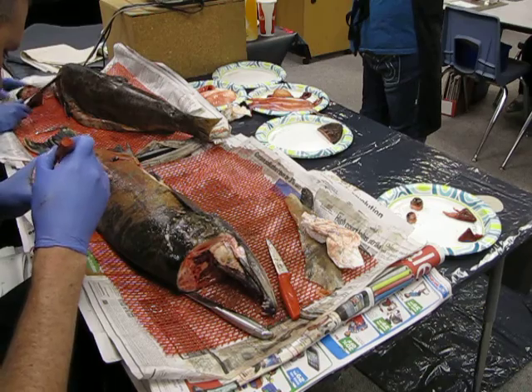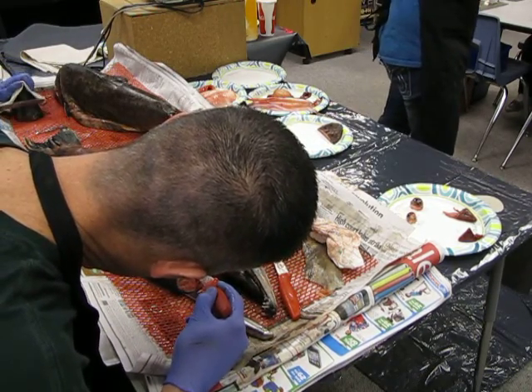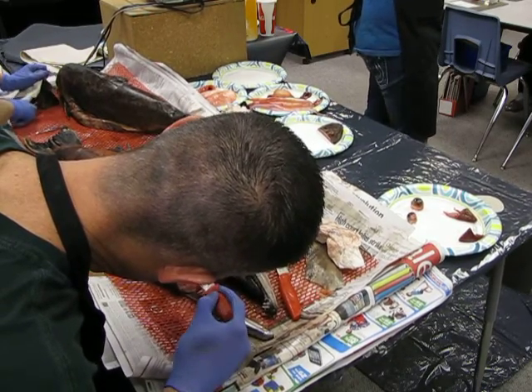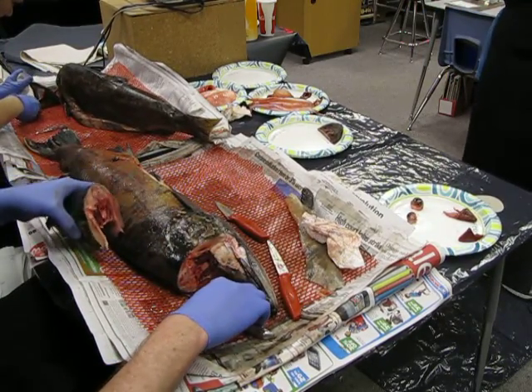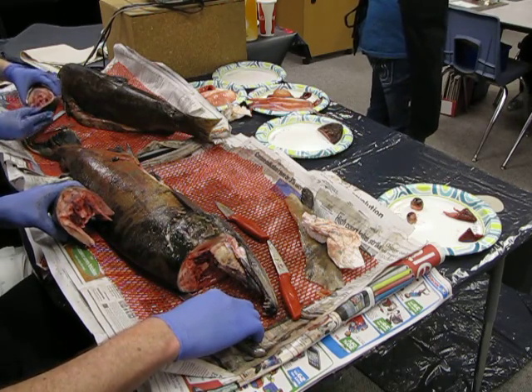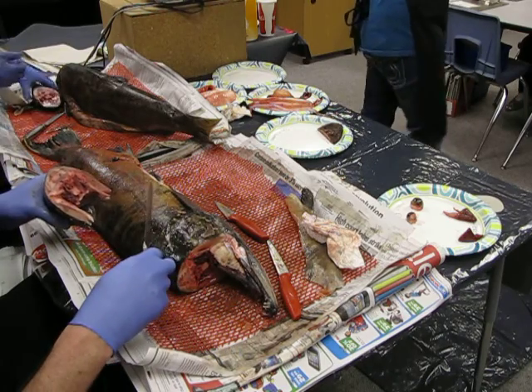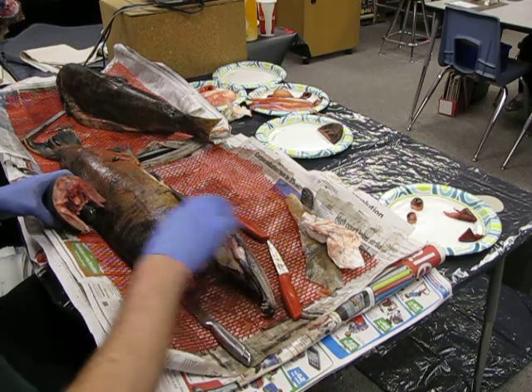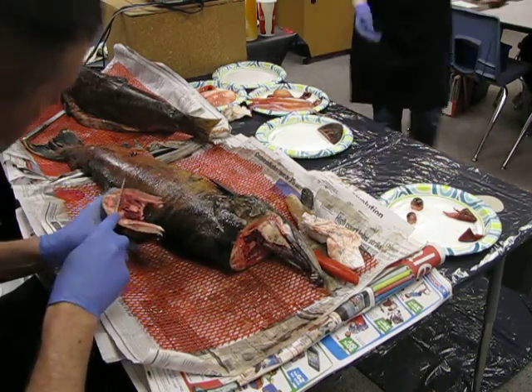They have something that protects the gills too, in the salmon's mouth, so nothing gets into the gills. They have these little pokey guys. These are called gill rakers. Gill rakers keep stuff from going into the gills themselves. And then this kind of looks like a mountain. That bone is called a gill arch. And I'll put the gills under here for you to look at.